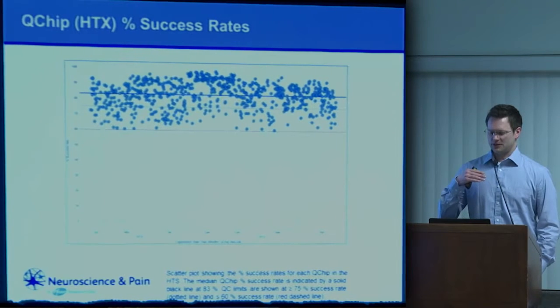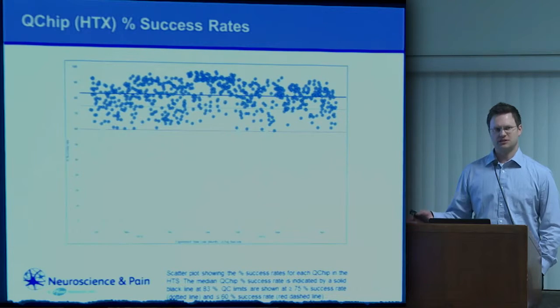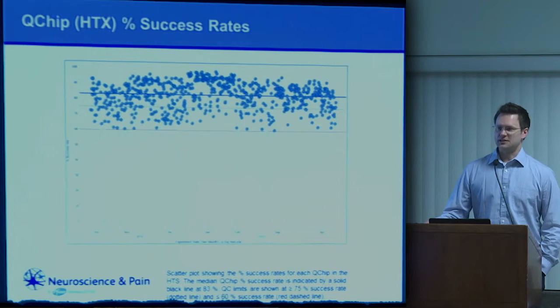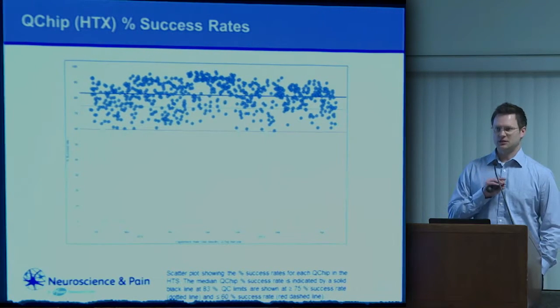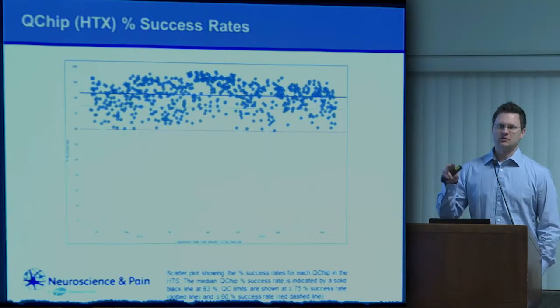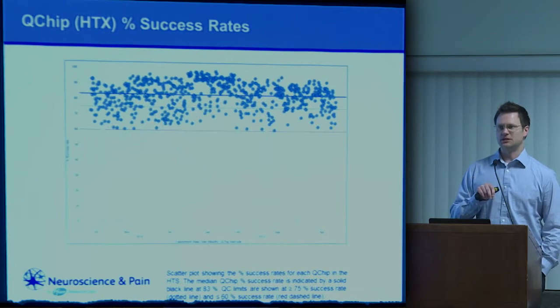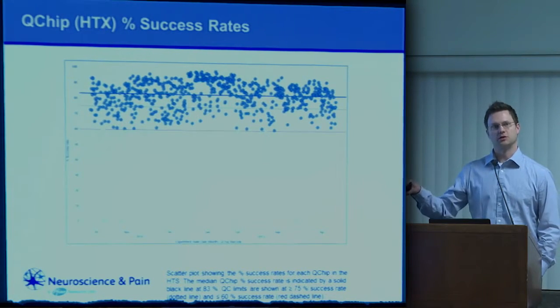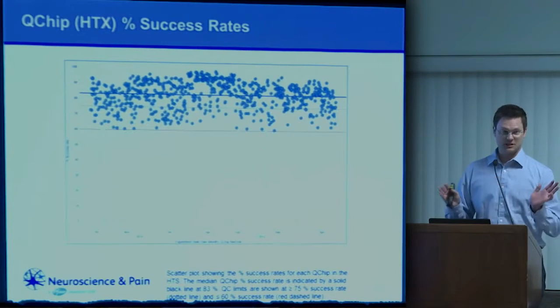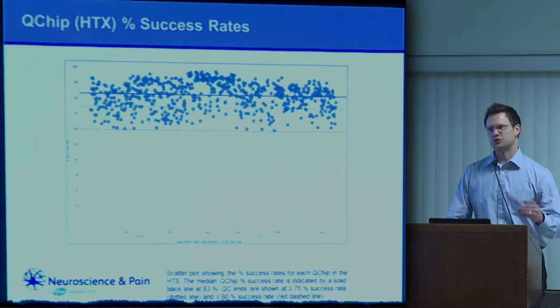And the question that I always get when I present data like these in comparison to traditional HTS data like Flipper, what do you do with the untested compounds? Well, that depends on your project. In this particular case, we decided that we would run everything through, and then the chemistry could decide whether there were any molecules in the untested part of the libraries that they were interested in terms of structure, and we would then pick those. You could, of course, just retest everything, but it depends on what your project priorities are. Here we were trying to push through as fast as possible.